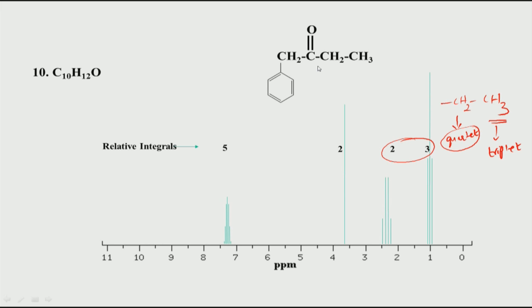Now, if we had a carbon spectrum with us, we would have looked at the carbonyl peak in the NMR spectrum, and that gives you a very nice peak at around 170 to 200 ppm, depending on the functional group. So, there is a wide range of distribution, depending on whether it is an ester group, a ketone group, a carboxylate group, or an aldehyde, and so on. Based on that, the carbonyl frequency is very specific, and that we can use.